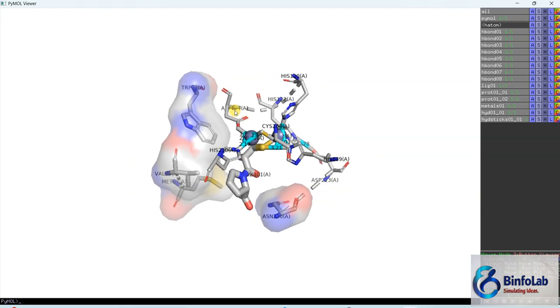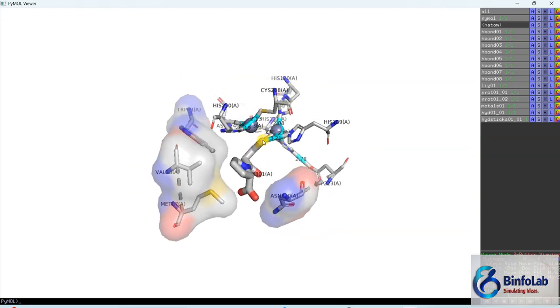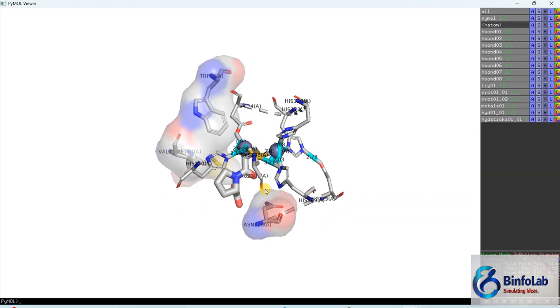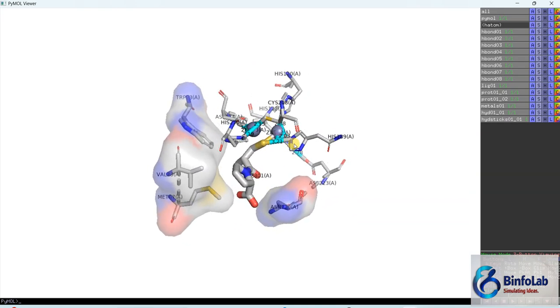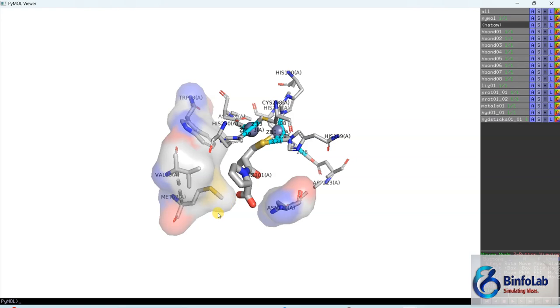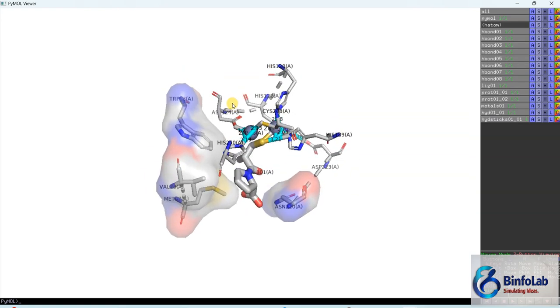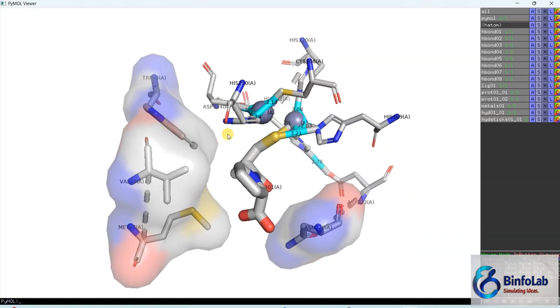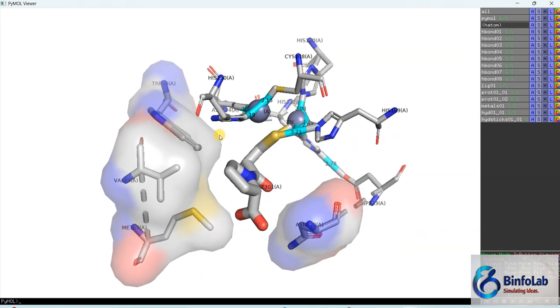So these are the different things, but I also see some strange behavior of my computer. So on your computer, you may be able to see these lines. And if you don't see that, that's also fine. You can use the distance command and generate these lines. So let me take this figure with high resolution, 2400.